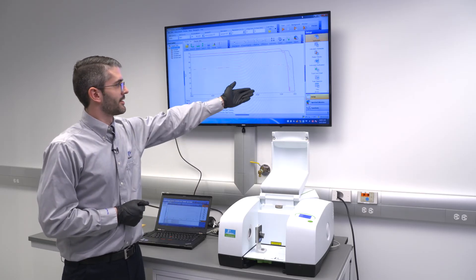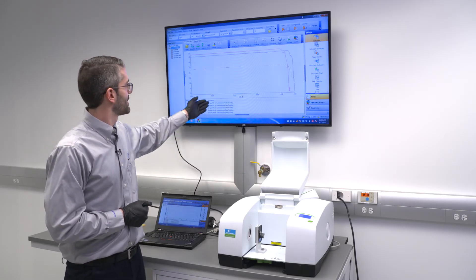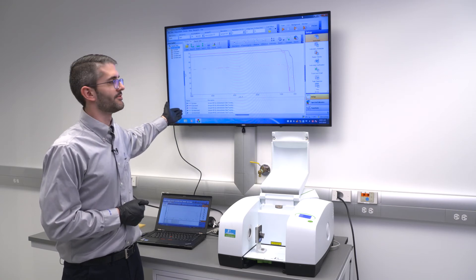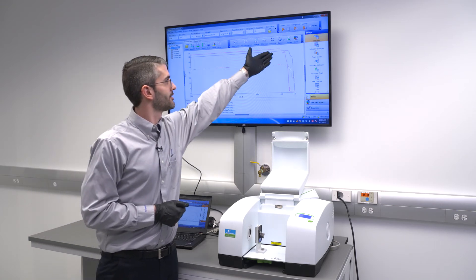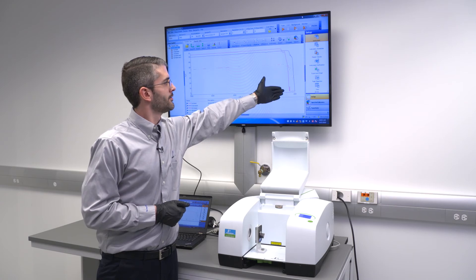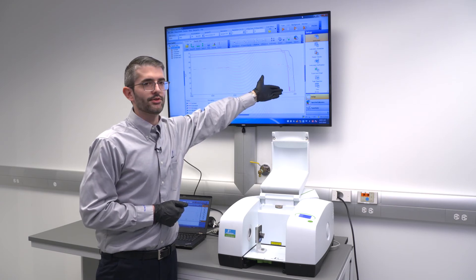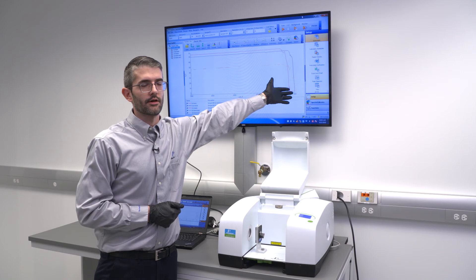Let's look at the long wavelength end of the spectrum as well. For one sample in particular, zinc sulfide, we find that there is a cutoff here towards the long wavelength end of the spectrum. You notice here that the spectrum does actually drop to zero beyond our cutoff here.